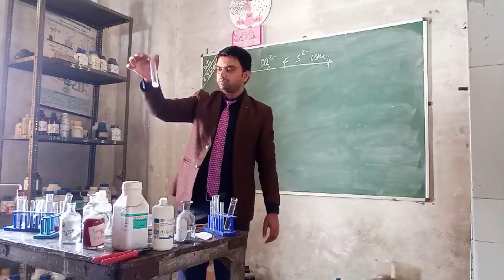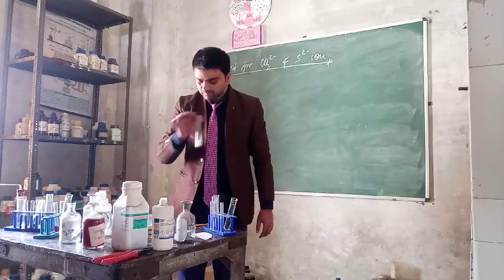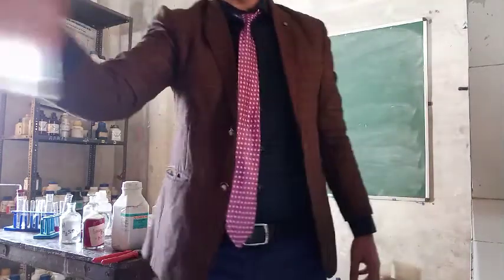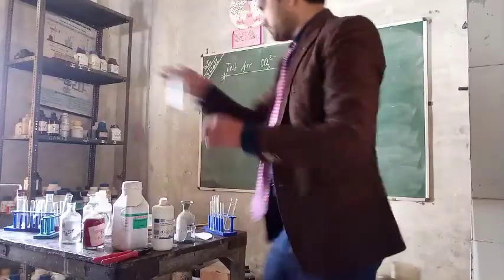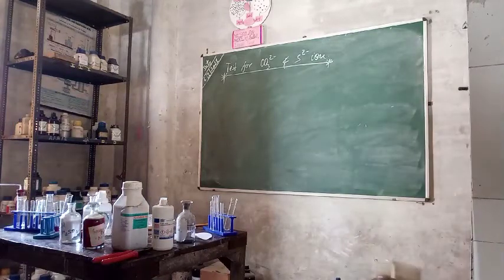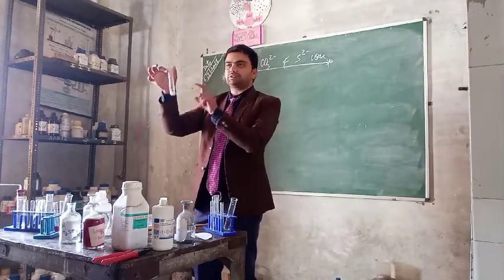This salt reacts with the H2SO4, so you can make the smell, the rotten egg like smell, which you will observe. After all, the rotten egg like smell has started.